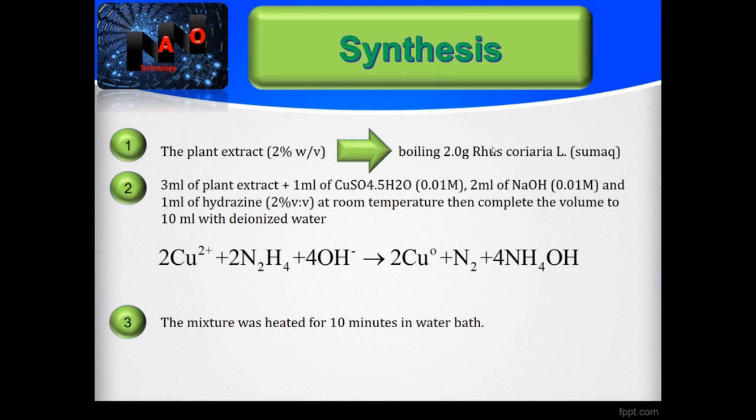The first step is preparation of Rhus coriaria or sumac extract. The plant extract was prepared by boiling 2 grams of dried well-grinded Rhus coriaria or sumac fruits for 20 minutes, filtering and completing to 100 milliliter of deionized water. The extract was stored at 4 degrees Celsius for further experiments.